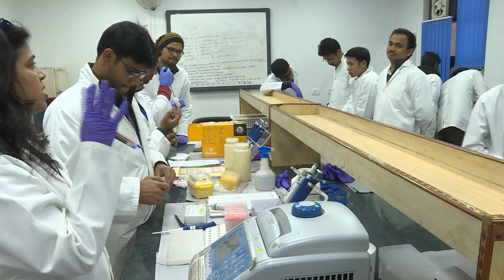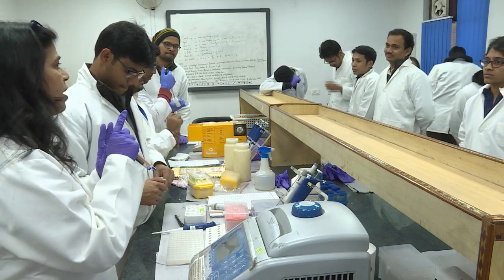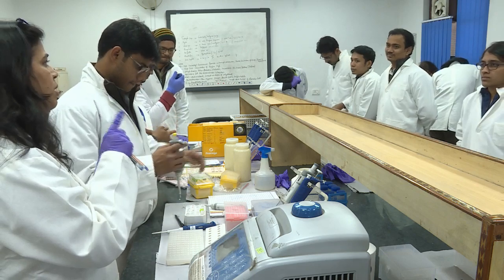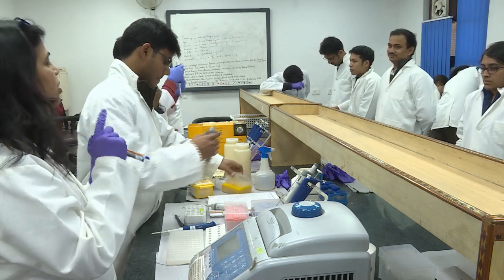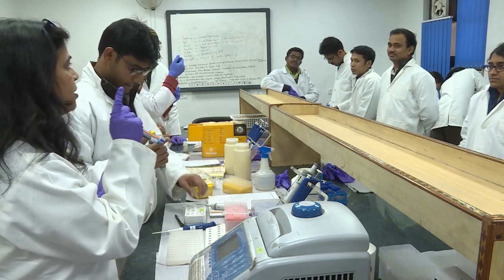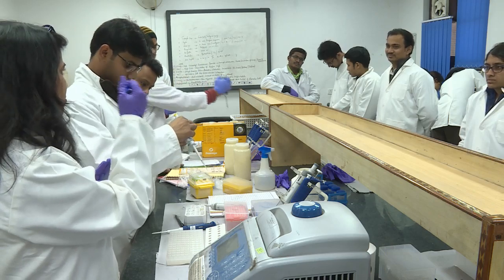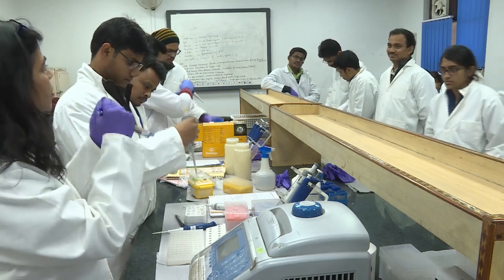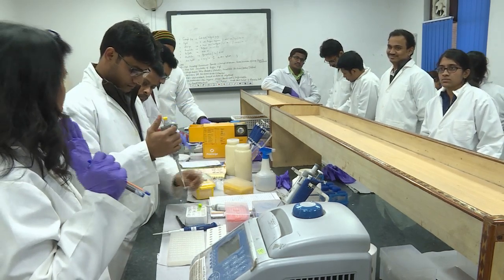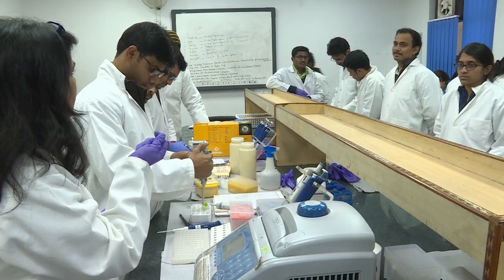Please just be confident that the calculations you are doing are correct, otherwise you won't be able to set up the reaction, right? Make sure that you do the calculations by concentrations, not by microliters, please. That is a mistake people commonly make, saying 'I put in this many microliters'. Please do not make a habit of it, always talk in terms of concentrations, right?